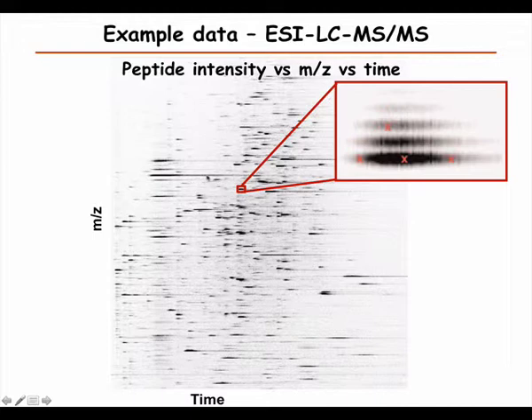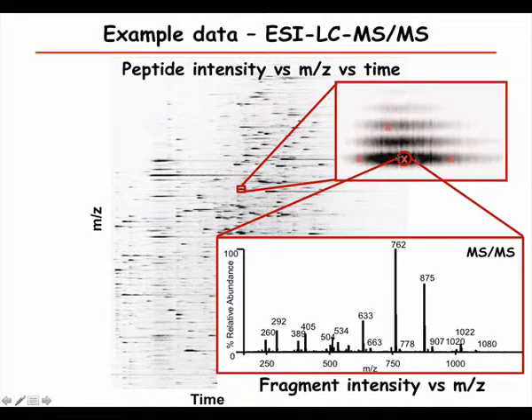So that's something that one should avoid, of course, because ideally they should appear and then just disappear pretty fast. But not so fast that one doesn't have time to fragment the peptide. And these X's here show where the MS spectrum has been collected. And that's the other dimension. So for example, for this one, we fragmented it and we got a very nice fragment mass spectrum.